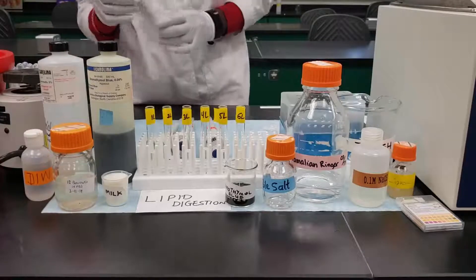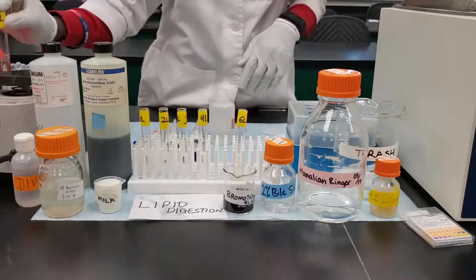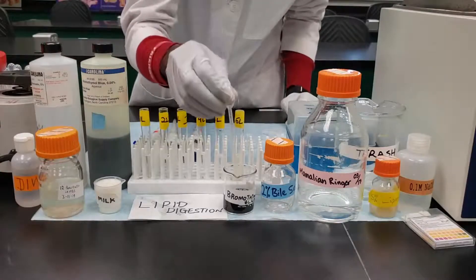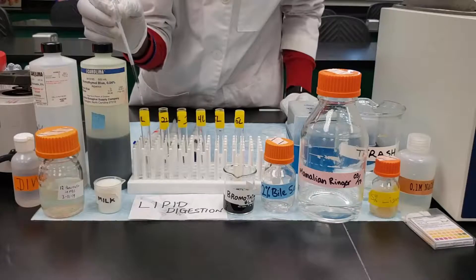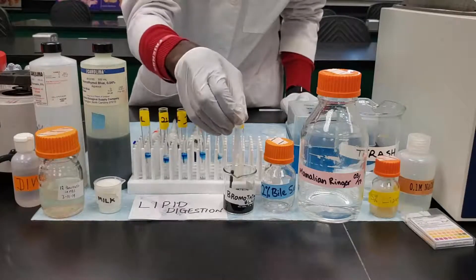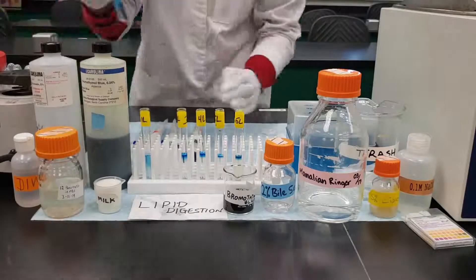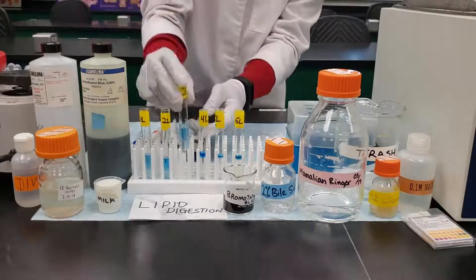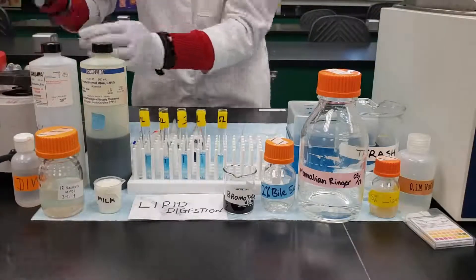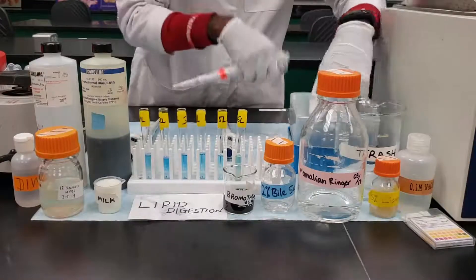Once you're done, mix your samples and make sure they are well mixed using the vortexer. After vortexing, add two drops of bromothymol blue to each of the tubes — it will turn the tubes blue in color. It has to be similar to the standard at 7.2 pH. I've already compared it with the pH standards and it's at 7.2 right now.